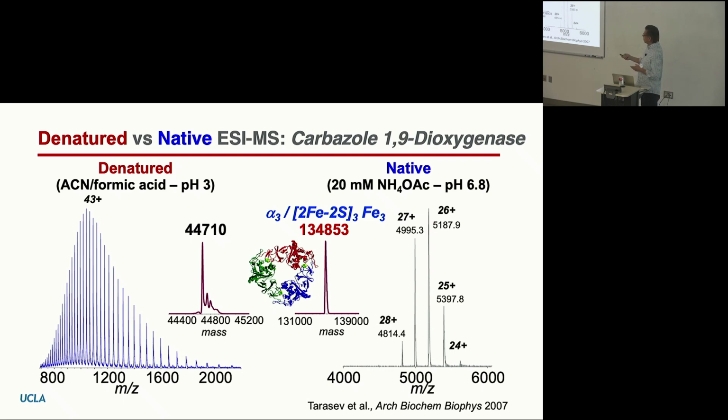So it's a homotrimer complex. Three subunits come together as an assembly. Plus there's a little bit of extra mass, because this happens to be an iron-sulfur cluster. There are these irons and sulfurs in excess that all conspire to be the full assembly of this enzyme. That's what the researchers at Michigan wanted to know at the time. And so that's just two measurements to determine what the assembly size is, what any cofactors present are, and what any ligands present are, just from this mass measurement.